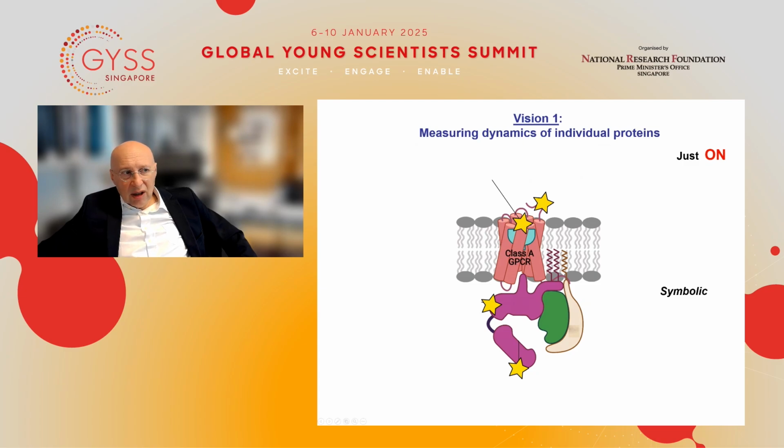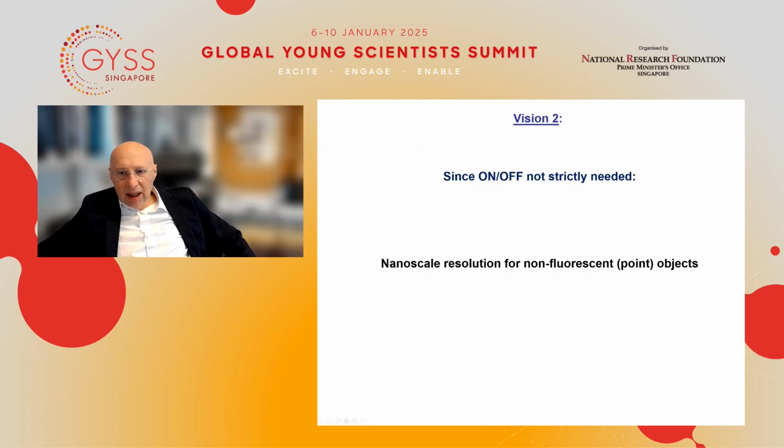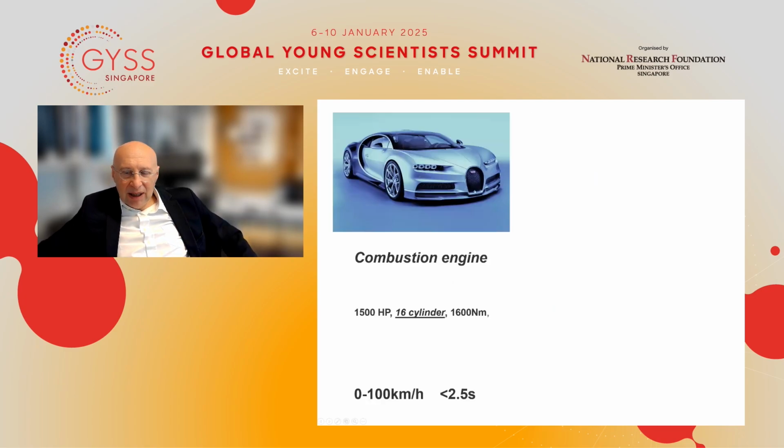Three years ago, four years ago, you would have said, or I would have said, there's no way of doing it because this principle was not discovered at that time. But now it's clear and it's sound, and it should tell us how proteins work. So in other words, where super resolution told us where proteins are in a cell, this method should tell us how they work mechanistically. So there's a lot of options that are coming up now.